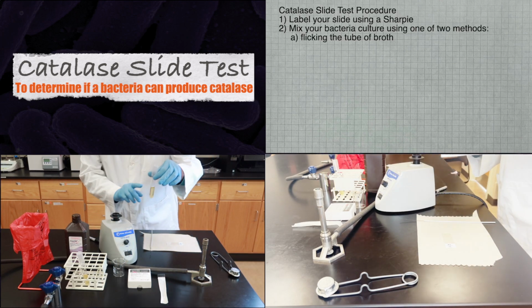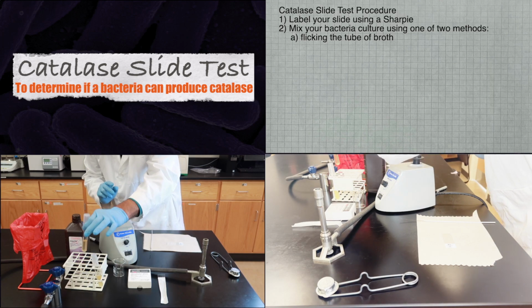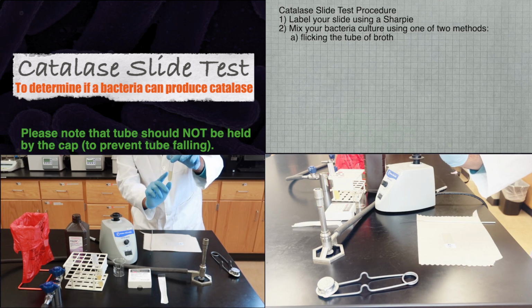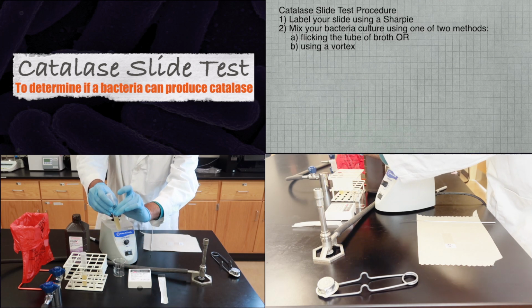Step 2, please mix your bacteria culture using one of two methods: either by flicking the tube of broth, as is demonstrated here, or by using a vortex, as is demonstrated here.